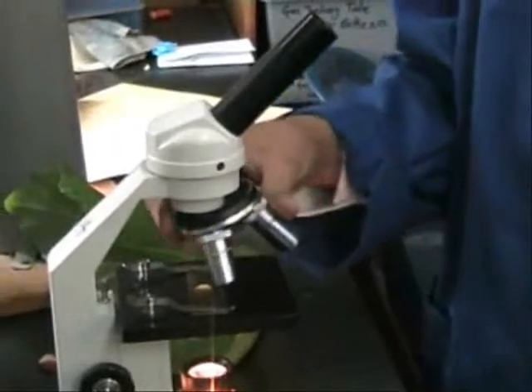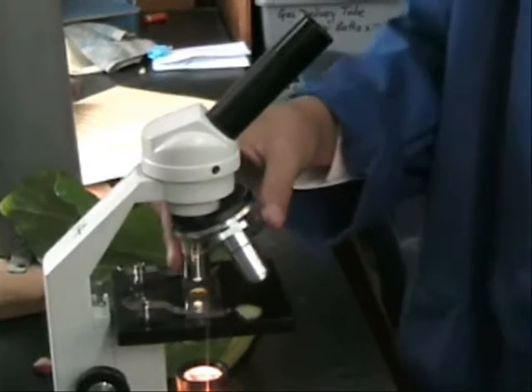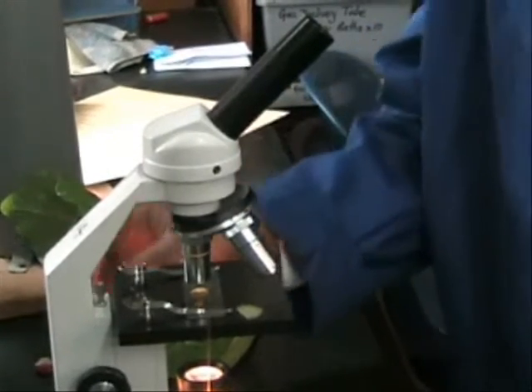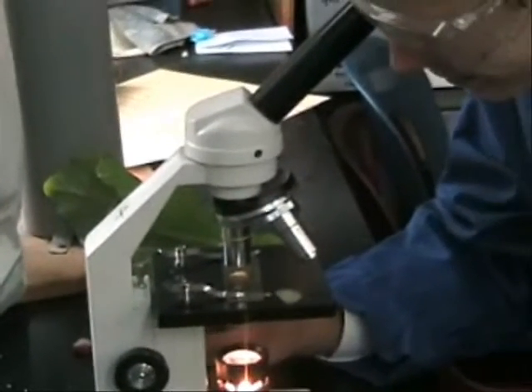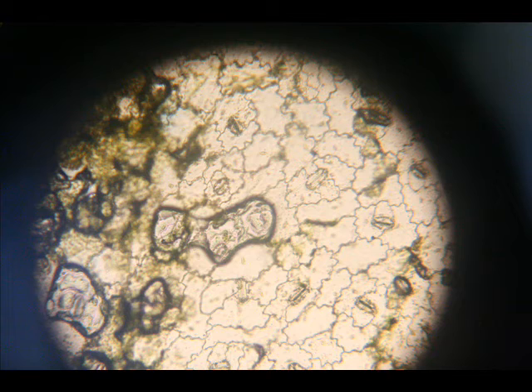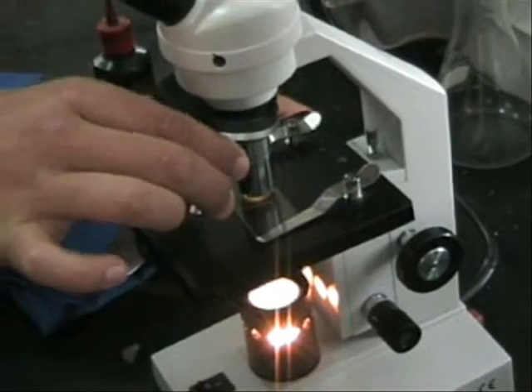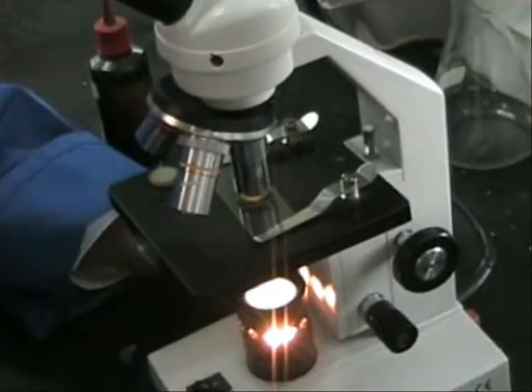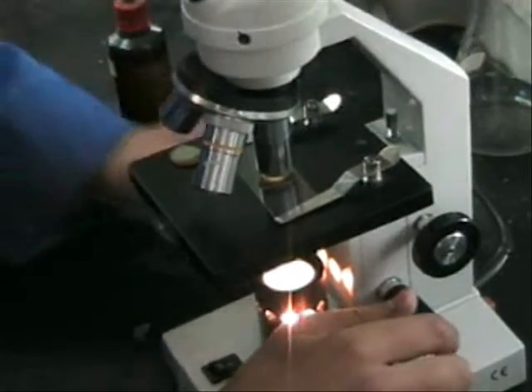Spin it to the second highest magnification and twist the small knob till it comes into focus. And slowly move the smallest knobs until it focuses.